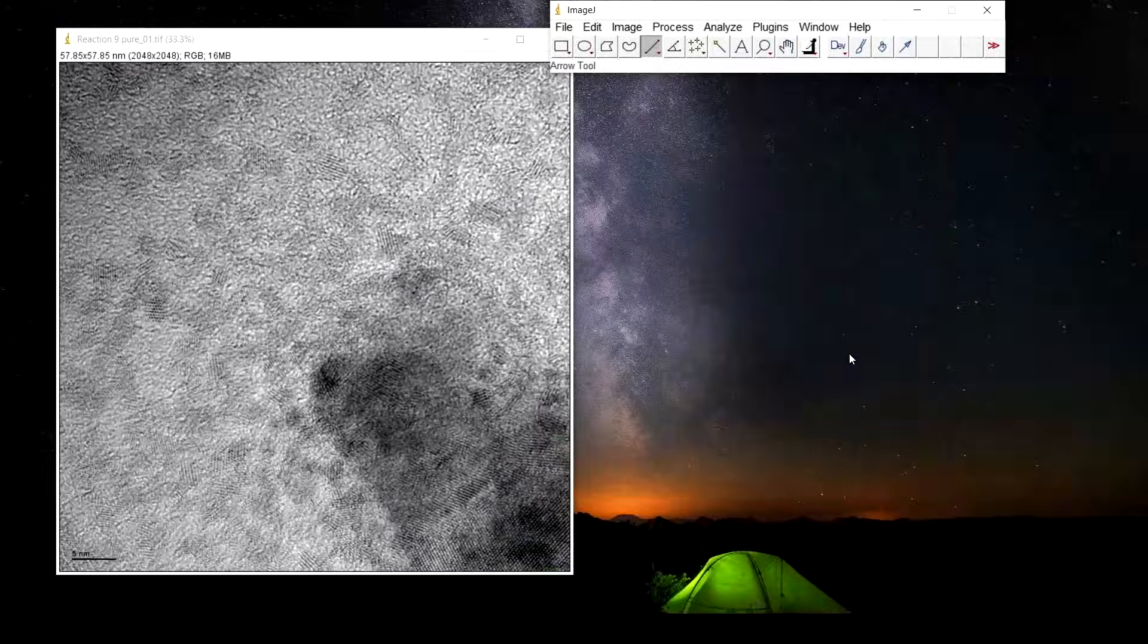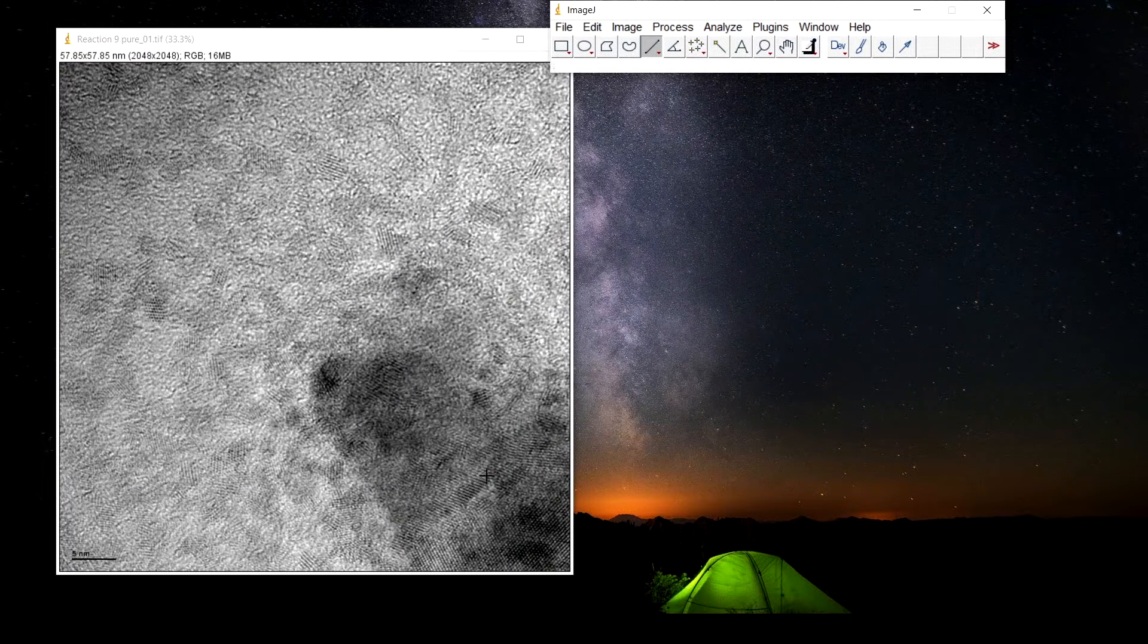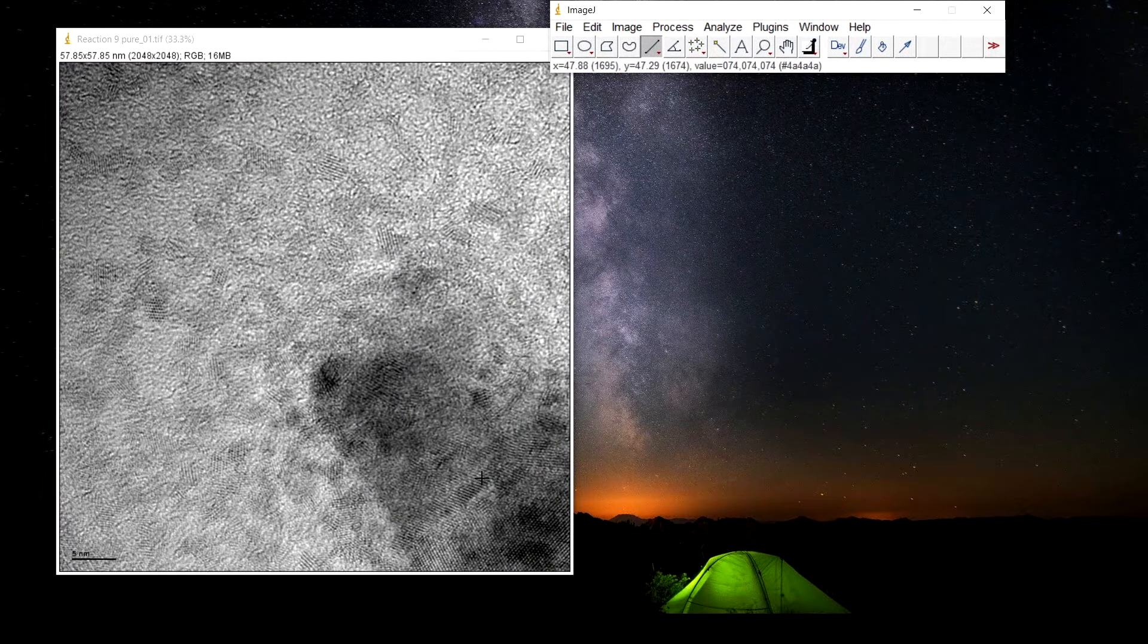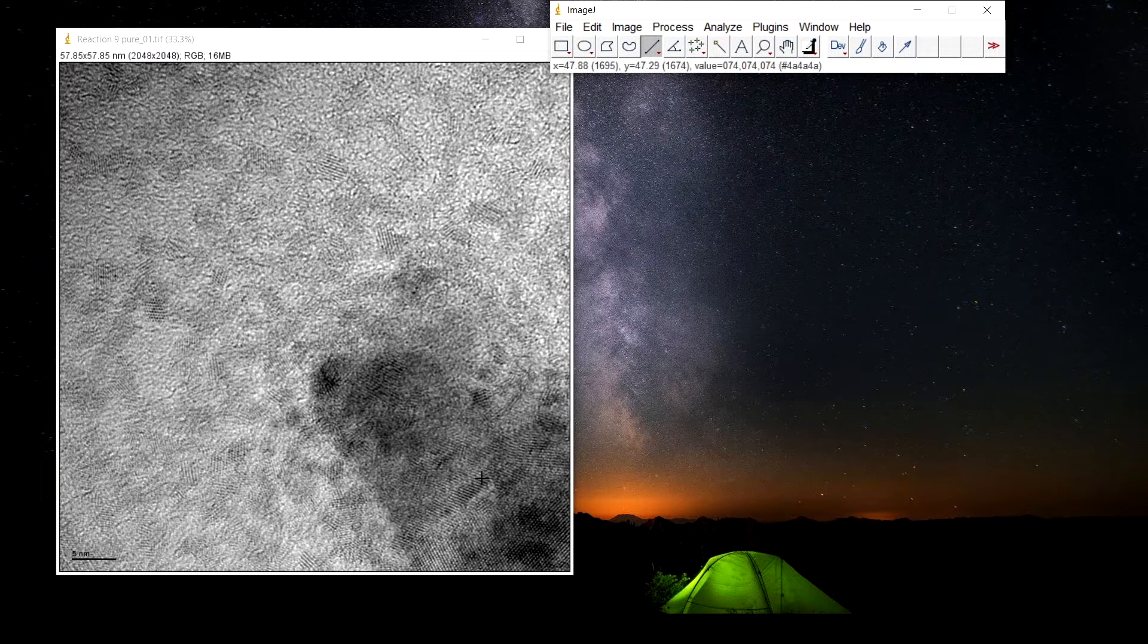Hello everyone, today we are going to learn to calculate the interplanar spacing shown in high resolution transmission electron microscope image.